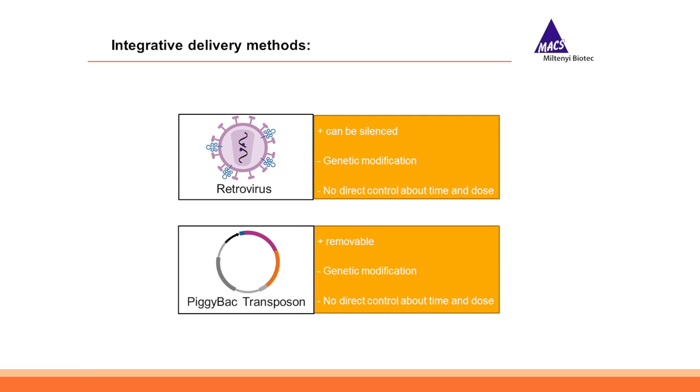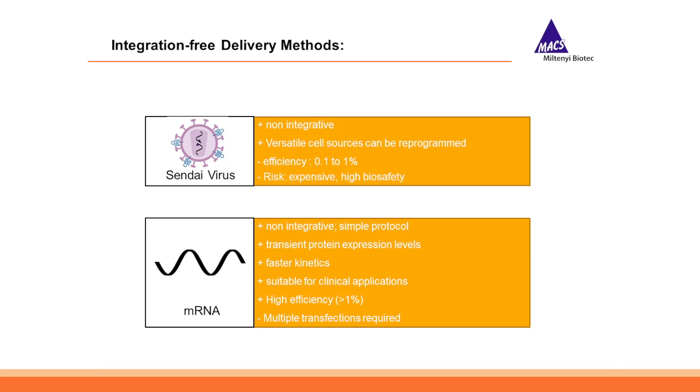Nevertheless, it is a genetic modification, and again, we have no final control about the time and dose of the expression of these transcription factors. For the integration-free delivery, there are also different methods on the market, and here I want to introduce two of them. The first is, where it is, here.